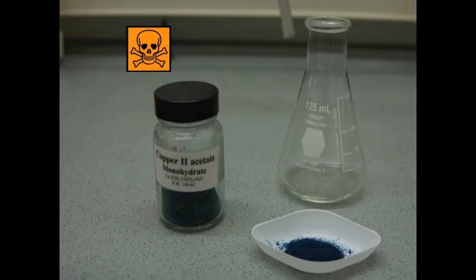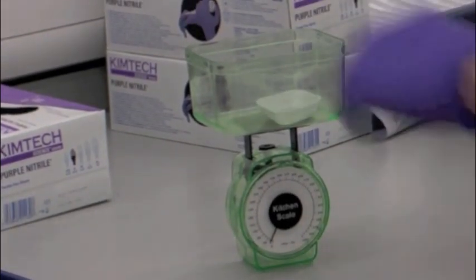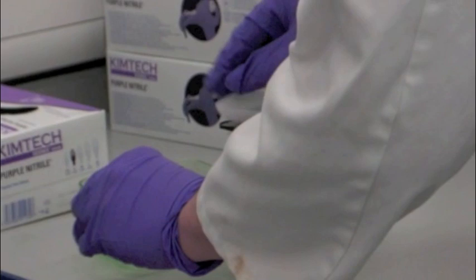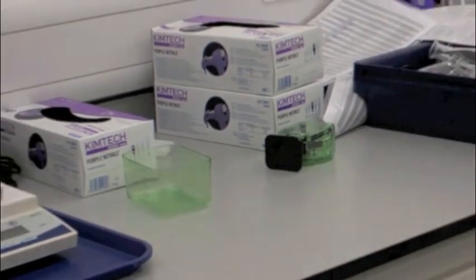Firstly, we need to weigh our 1.5 grams of copper-2-acetate monohydrate. No, not using kitchen scales — using a top-loading balance, you wally!